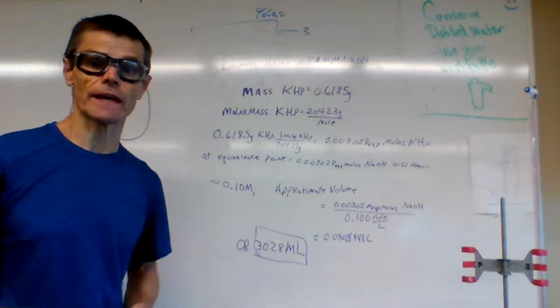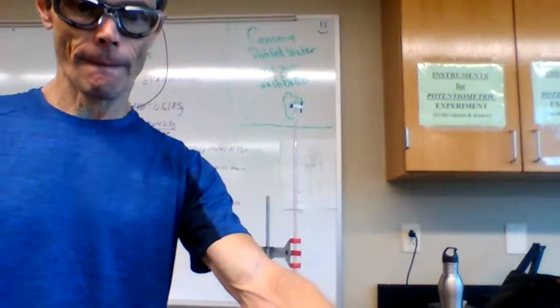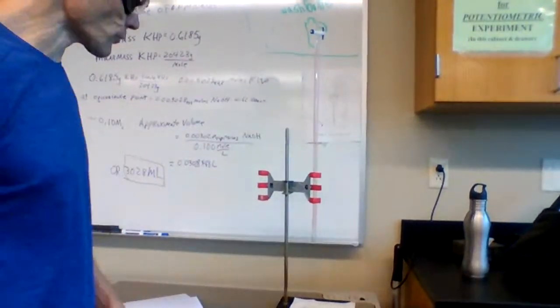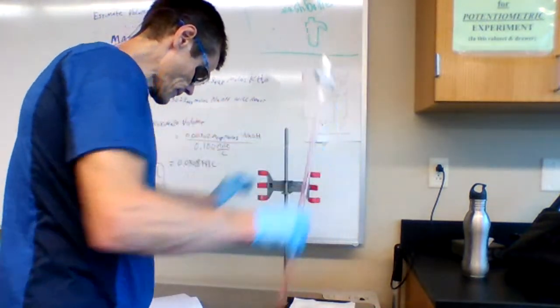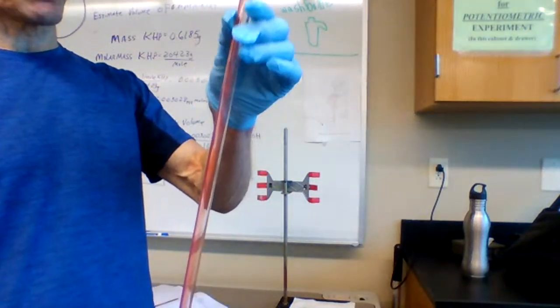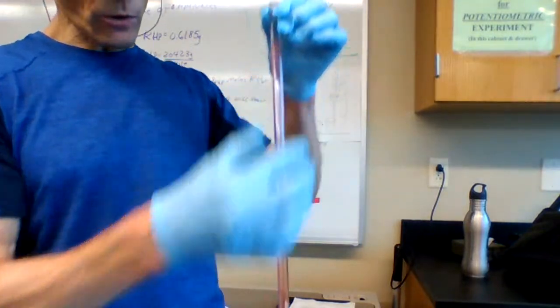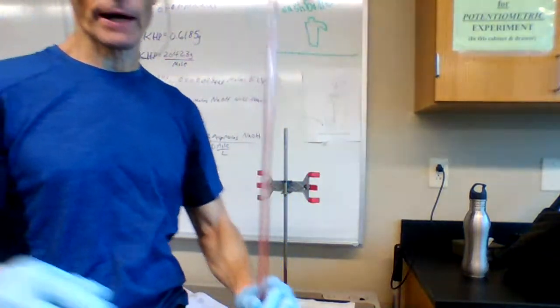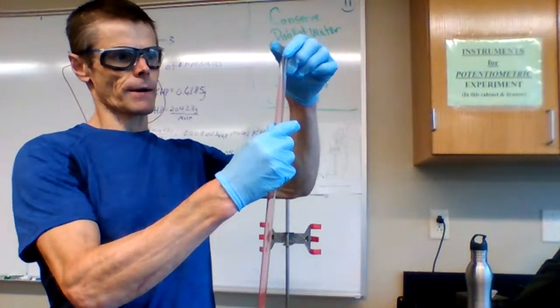So let's move now to the actual titration. I have it set up, or started to, over here. So here's how you're going to be working in the laboratory. You're going to have your burette and a burette stand, and you would clean out your burette. Now your burette has scale markings. It starts at 0 and it ends down here at 50. So when we read a burette, we read the burette from top to bottom.